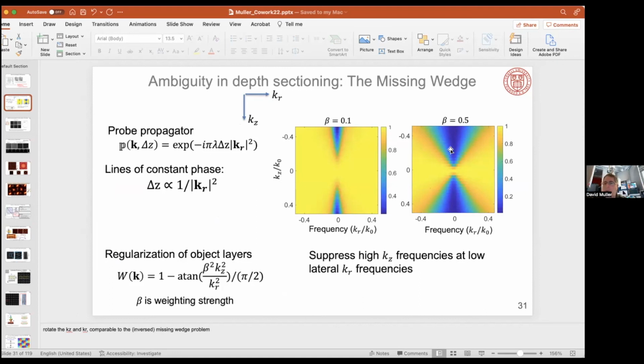So back in the days when I was doing electron tomography, which we've been doing for about 20 years now, this is our missing wedge for elongation factor when we got the early aberration corrected microscopes. And we thought about doing serial depth sectioning in annular dark field. It became clear that the numerical aperture of my lens effectively introduced this missing wedge, which normally is the highest tilt angle that you recorded. And having a numerical aperture of 1 degree means you're doing plus or minus 1 degree tilting for tomography, which is not very good.